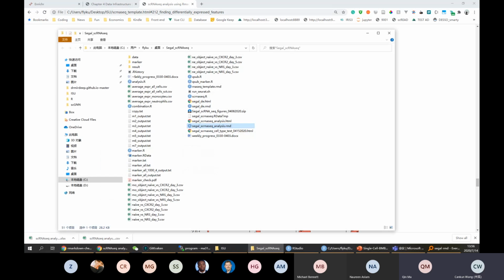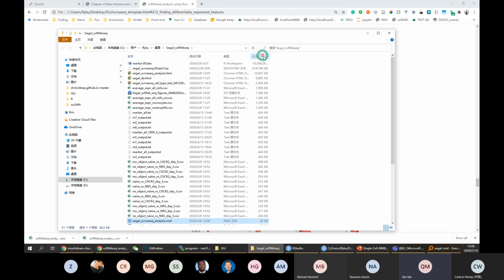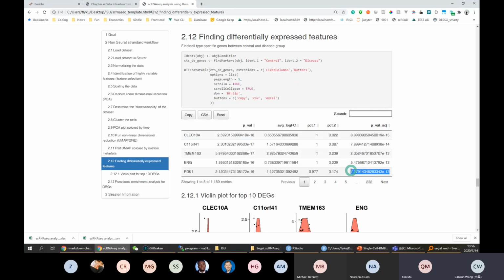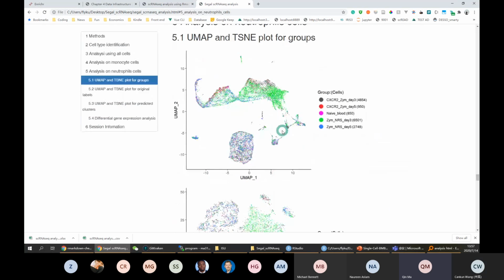Following up on the question, usually for differential gene expression analysis, maybe at most the first 1,000 to 2,000 variable genes matter. We do not have to showcase all the 20,000 genes in the human genome, because usually the first 2,000 can answer all the questions you have. So based on those estimations, I think you should be fine for the table, unless you really need to show several thousand. That will be a little bit challenging, but thousands should be okay.